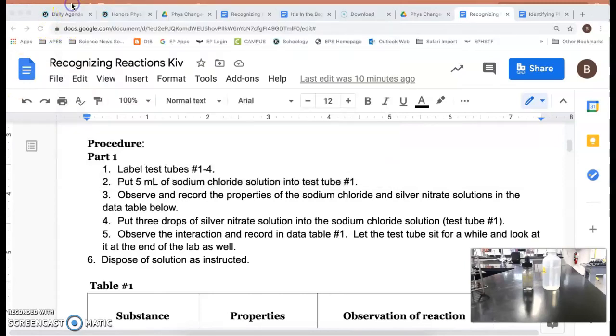All right, happy Wednesday. We are going to be doing the Recognizing Reactions Lab. I'm certain you've got that open already. We're going to have to do this in two videos because the fourth part is going to take some time, and I'm not sure that I've got a 15-minute limit on the video time. So I think the first three will probably take about 10 to 12 minutes to get through, and then that last one might take a little bit longer than 5 minutes.